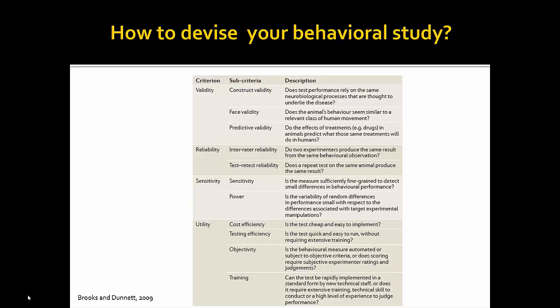And then, of course, thirdly is utility. Is it cost effective? During my postdoctoral time, I learned to make apparatuses versus buying a $10,000 apparatus. You kind of learn to put wood together, put cameras on there, and be an eBay shopper. One of the questions that will come is, can you implement it easily? Does it require a lot of training? Do you have the training to do it? Do you need to go somewhere to get the training done and then come back? These are just things that are inherent in any kind of assay that you would be starting up.